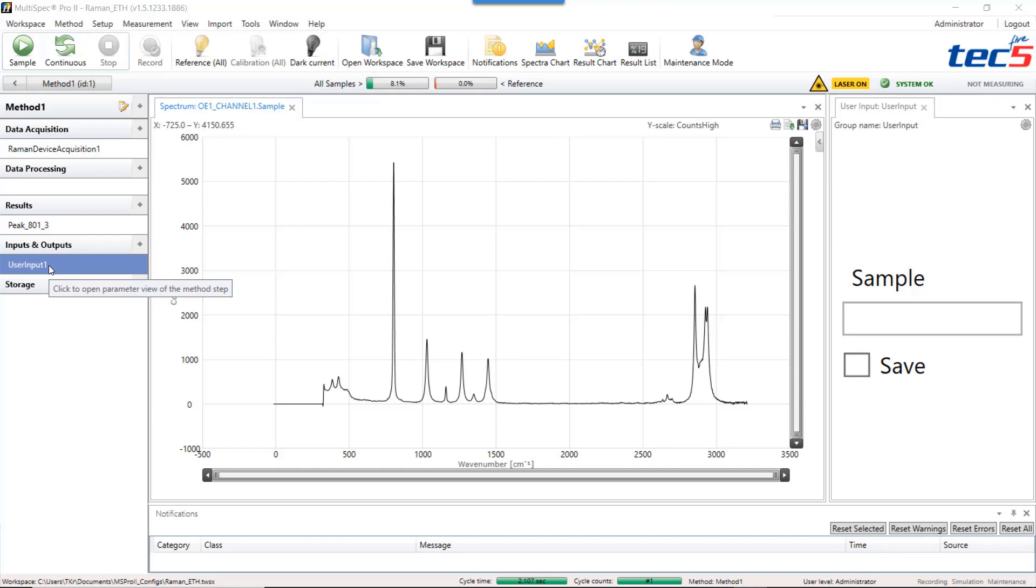Multispec generates spectra and results with every measurement cycle. You can store both in the storage section of the method.